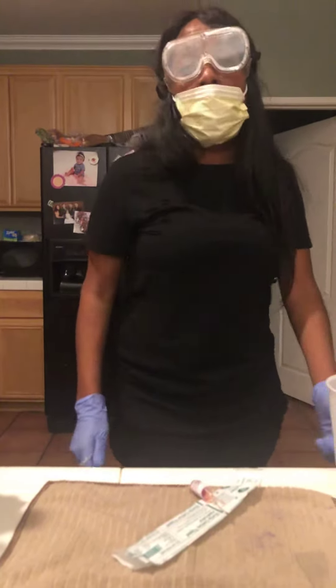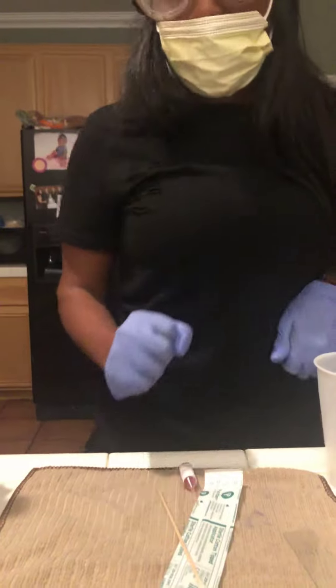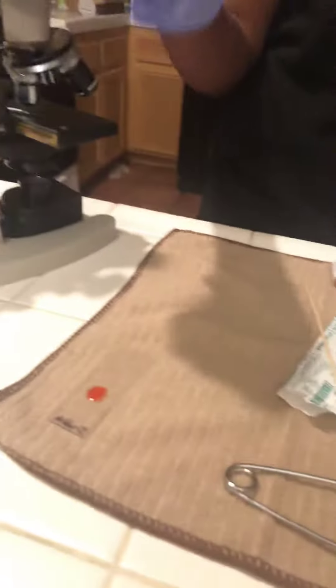Hello, my name is Desiree Hunter and I will be doing the negative direct stain. I already have my slide labeled and I already placed the Congo red.